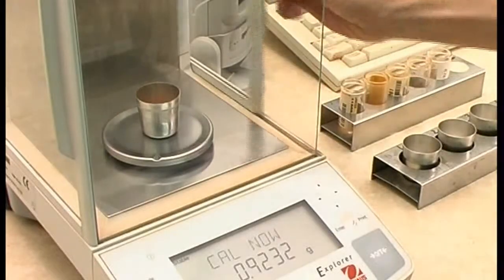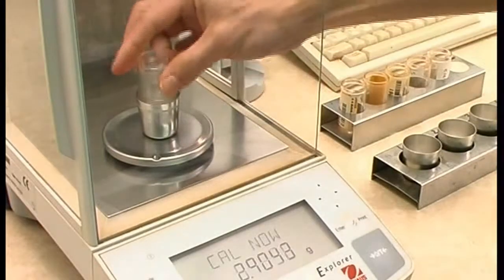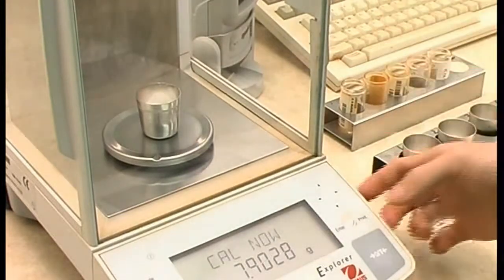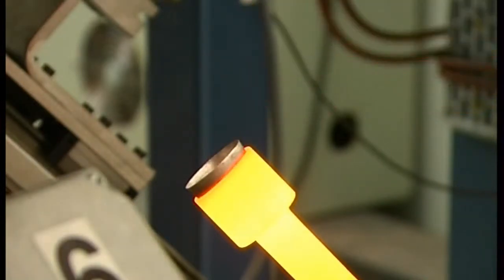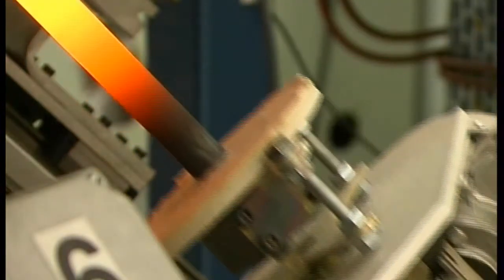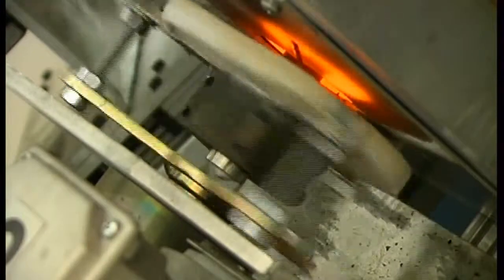The sample and flux are manually weighed into platinum crucibles. In turn, the crucibles are loaded into holders that are raised into the furnaces, where they are rotated to provide intimate mixing.